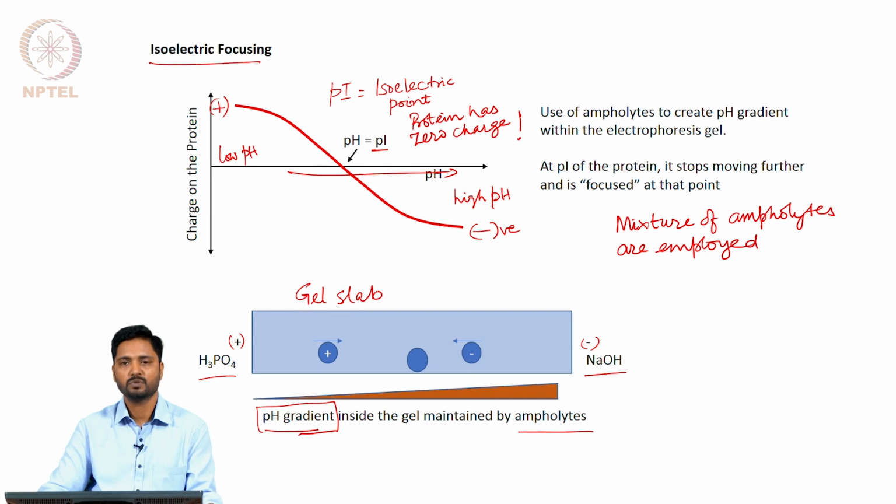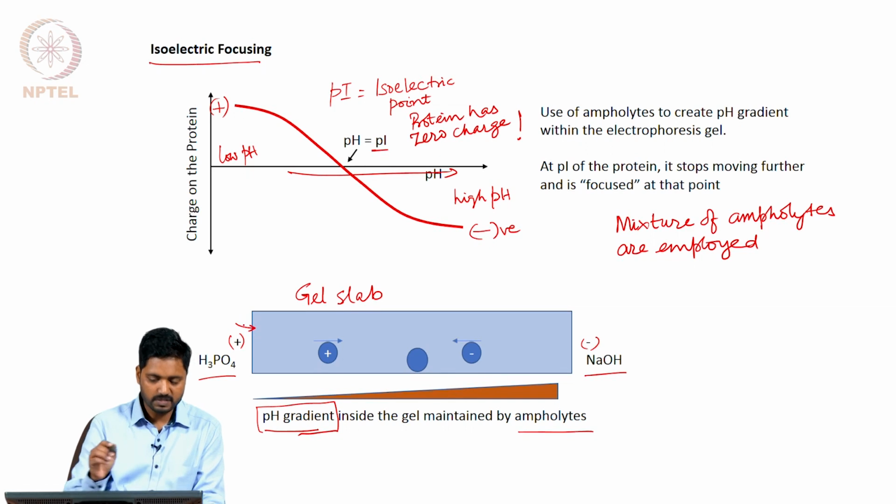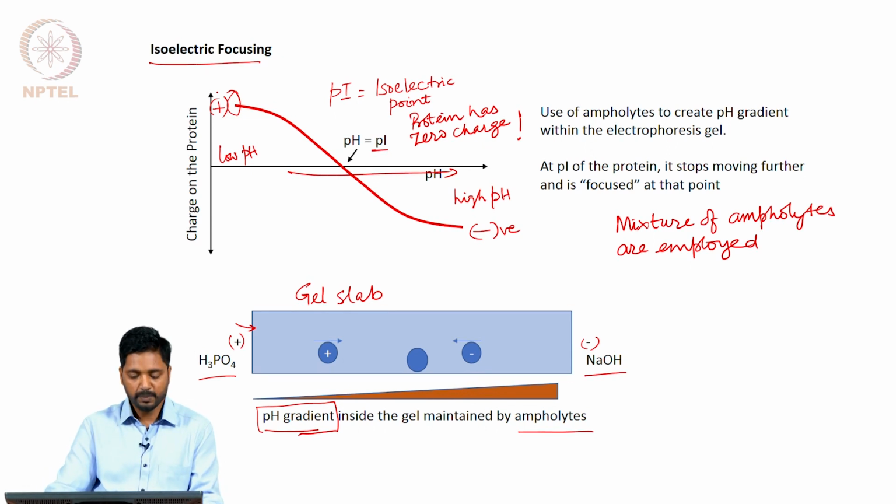By use of this mixture of ampholytes. So, as our protein is added from the left side, it is experiencing a low pH region and is positively charged.